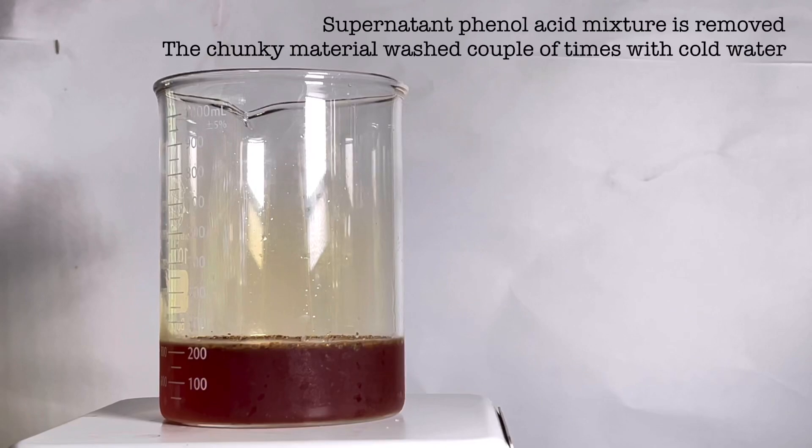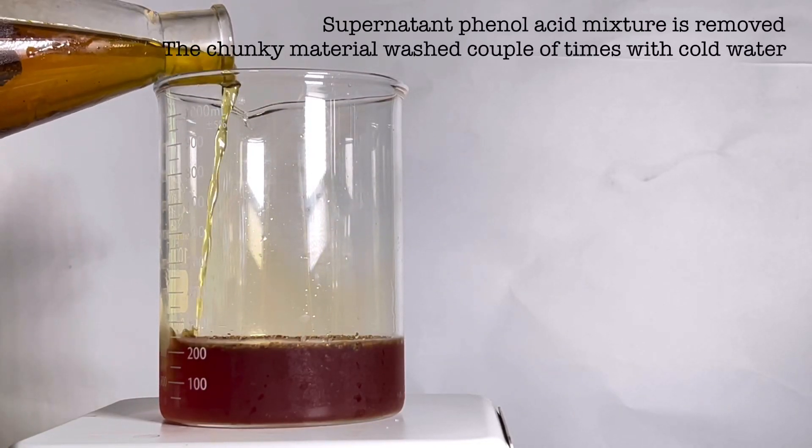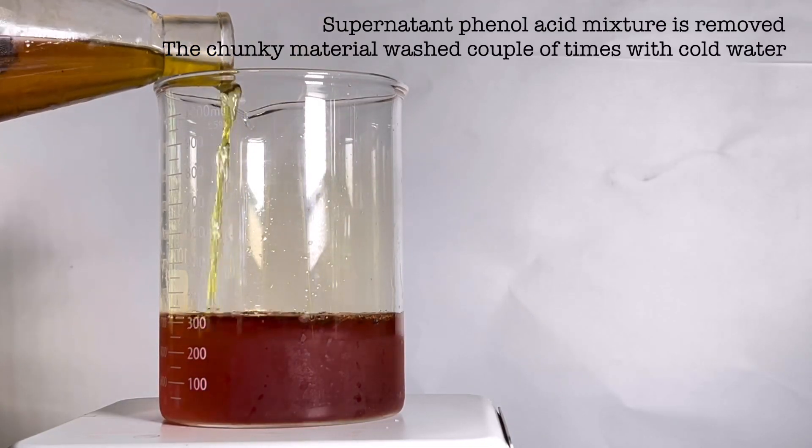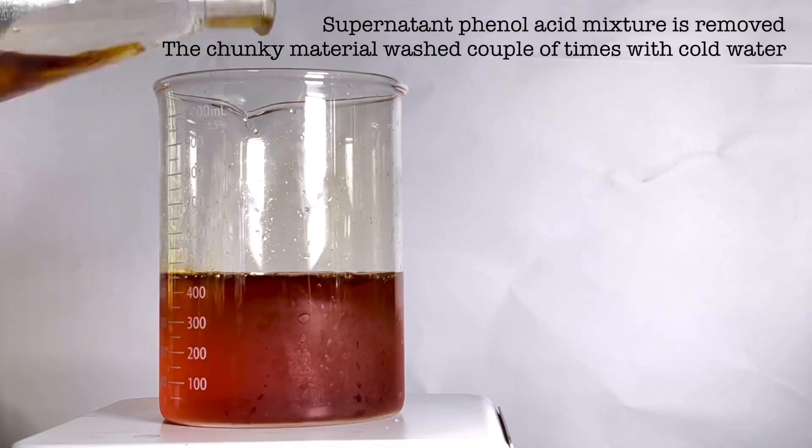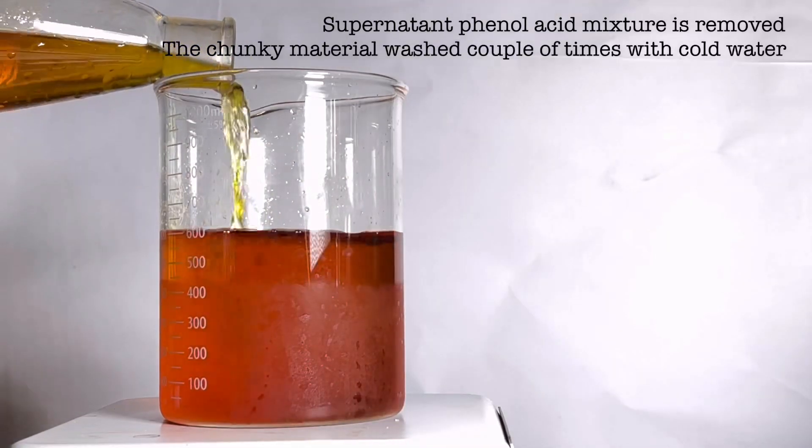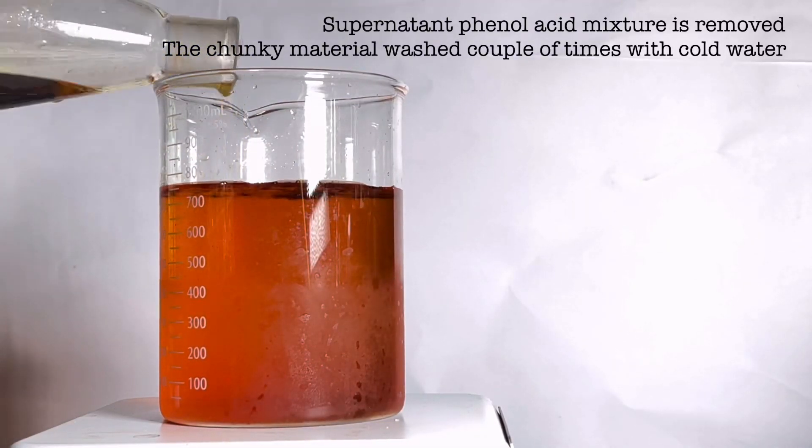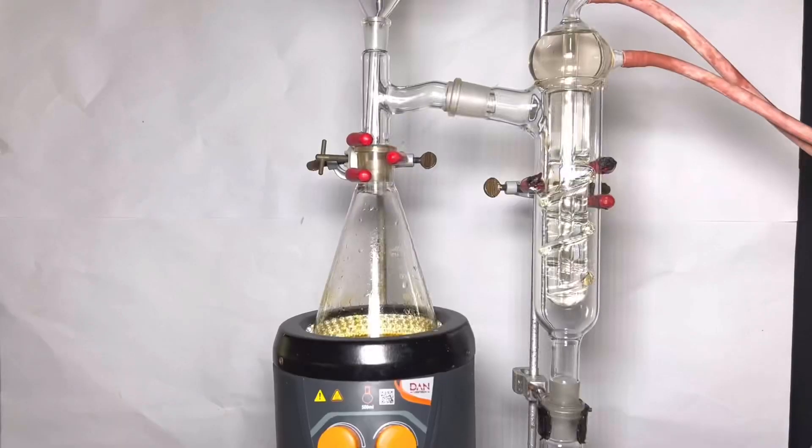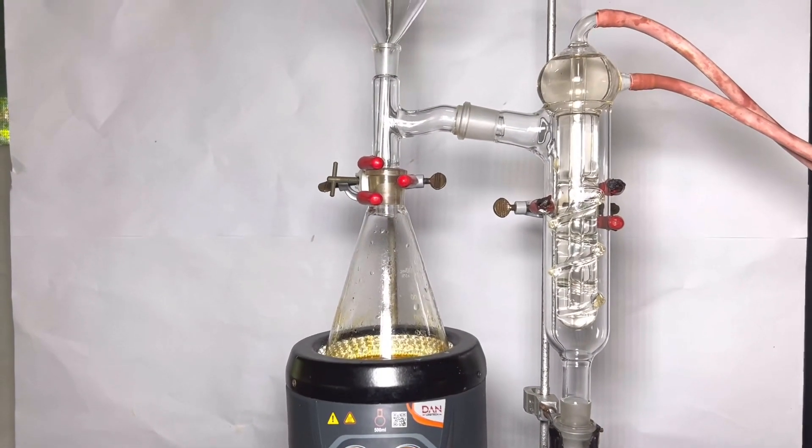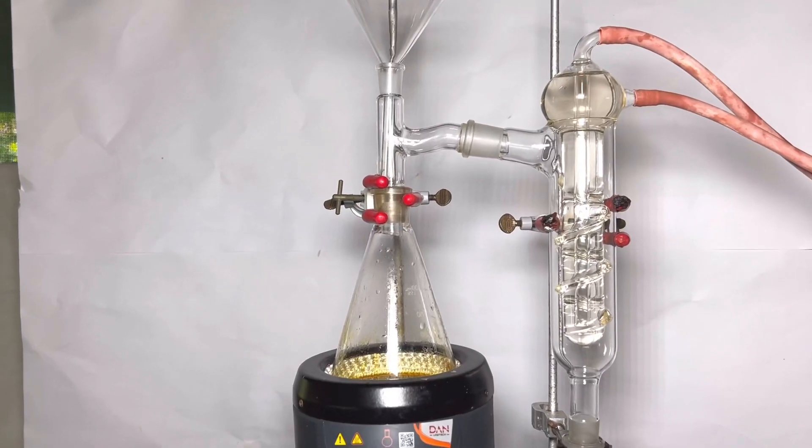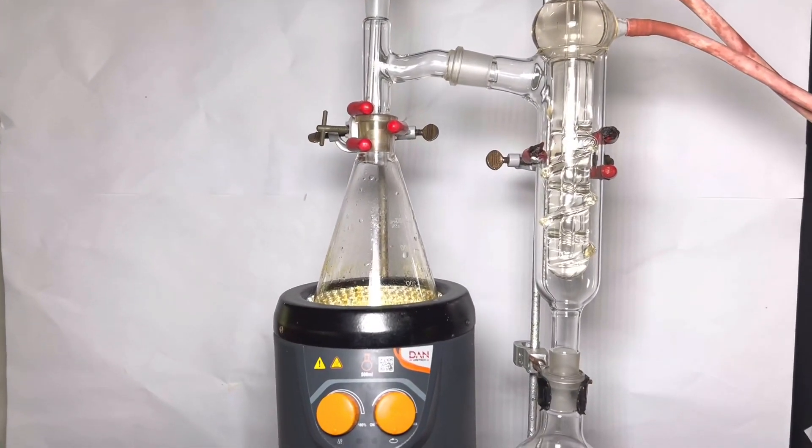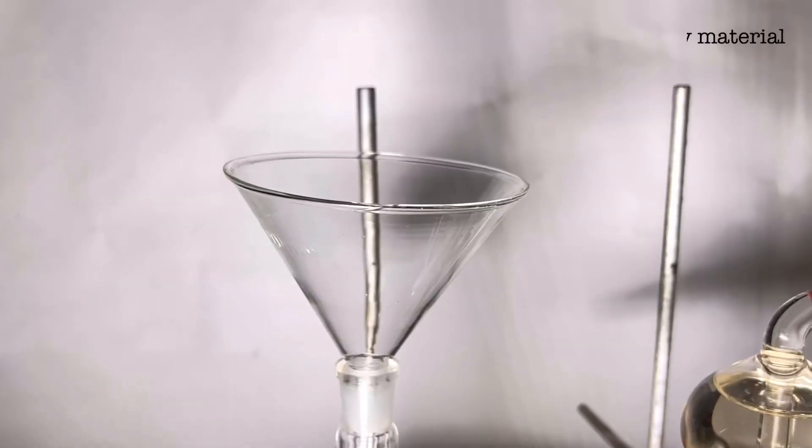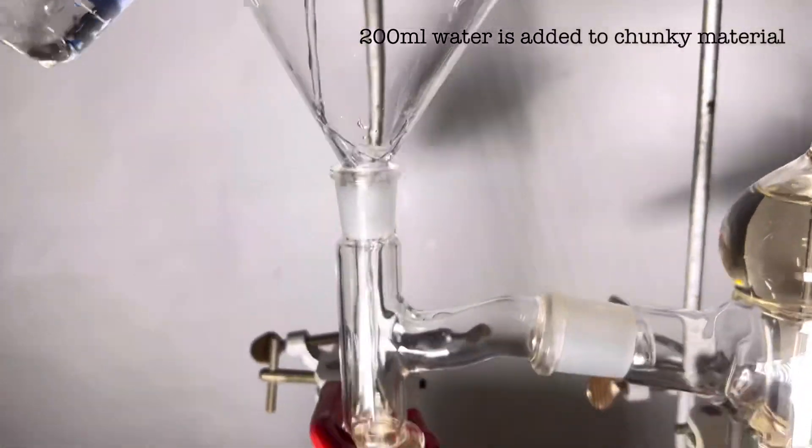Then the chunky materials were washed a couple of times with cold water. This helps to clear out all the acid from the product. Now the crude product is taken up into a distillation system. The flask is placed in a heating mantle and around 200 ml of water is added to the distilling flask.